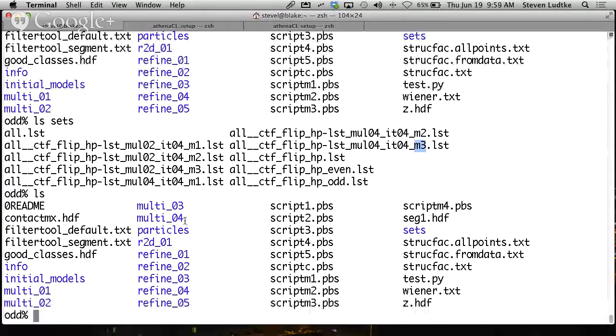Now, you'll note I don't have output files for all of the different multi-refines I ran here. What happened is I didn't let all those multi-refines finish. I started them running and I decided something was wrong and I stopped it, but I didn't delete the multi-refine directory. These are only generated after the final iteration completes. Now there is a program that you can use to generate these manually from a multi-refinement. Say the multi-refinement didn't finish, but it converged far enough, and you still want to generate these files. There's E2, I have to remember the name.